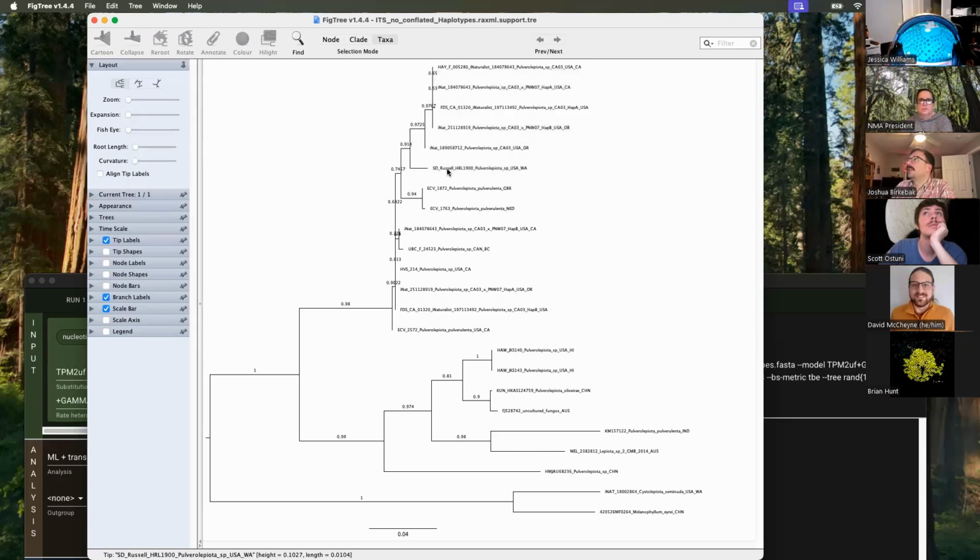That's right, actually, because I think this is Renee's, the one that has PNW05. Maybe we would have wanted to exclude that one, because I think it's conflated a bit. That's the one that needs a rerun. Is that the one you were looking at with all the frame shifts?